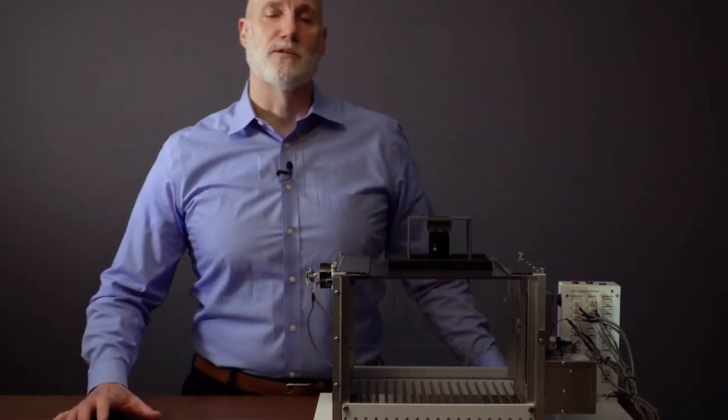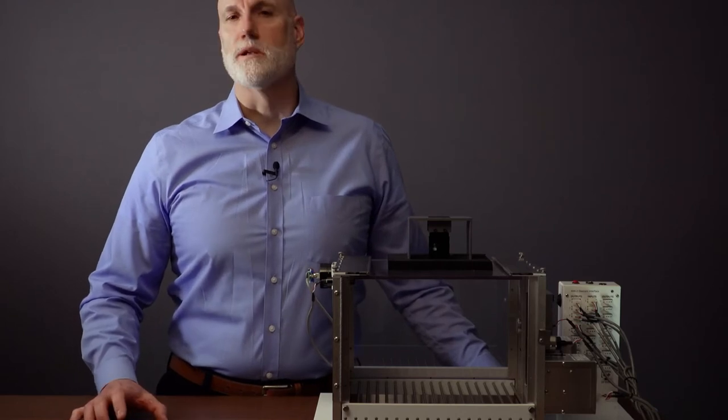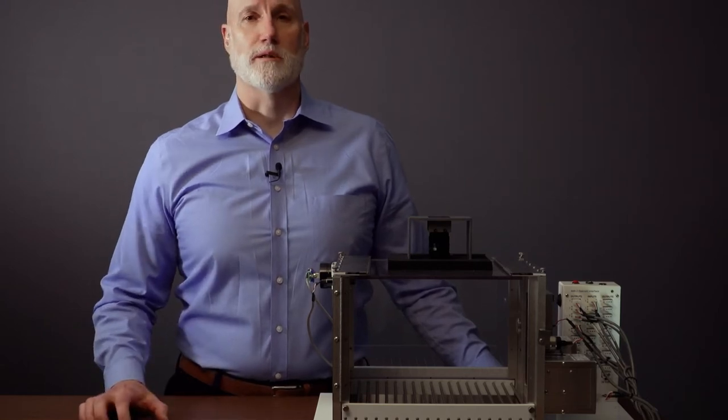Now, chances are you're going to use multiple cages, and you'll find that you'll set those up exactly the same way. What you want to do is note the connections for your first cage, and then set up all the other cages exactly the same way. We'll find out why that's important a little later.